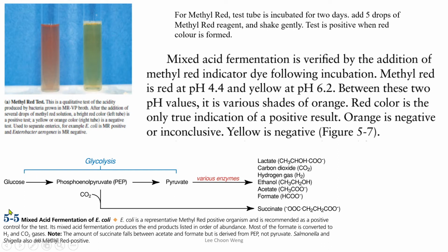What we are looking for is the mixed acid fermentation, where the bacteria ferments the glucose and produces stable acidic end products.